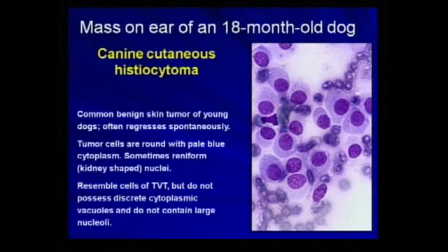This particular neoplasm probably has not been there that long. I don't see any lymphocytes, although we're only looking at one field. And remember, as these tumors regress, you will get a marked rise in the number of lymphocytes and a marked decrease in the number of these neoplastic cells.